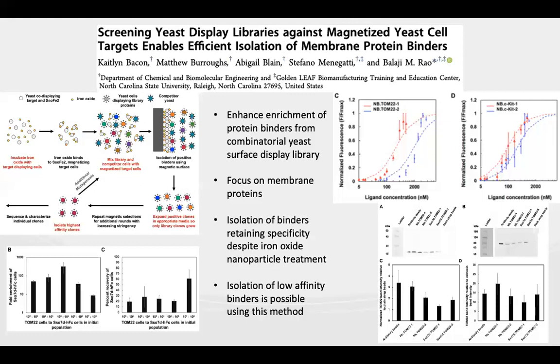They also examined SSO7D, C1GY, which is an irrelevant mutant, but has really similar residue composition at the binding interface. Using both of these controls and others, they were able to see that they could isolate very specific clones despite similarities between the relevant mutant or a presence of the F2A ribosomal skipping peptide, which would show that the full construct is present.